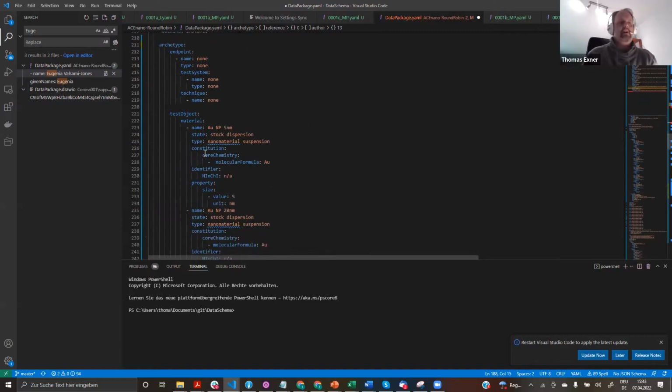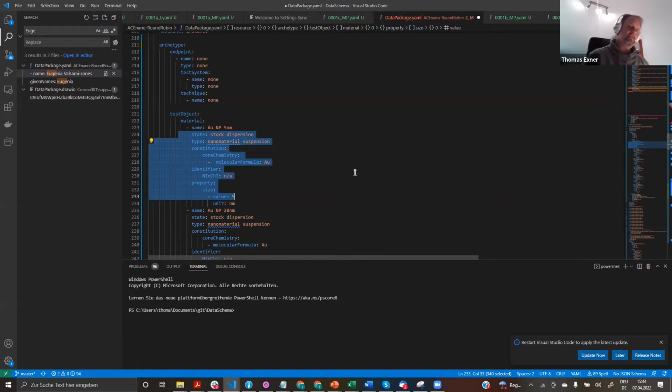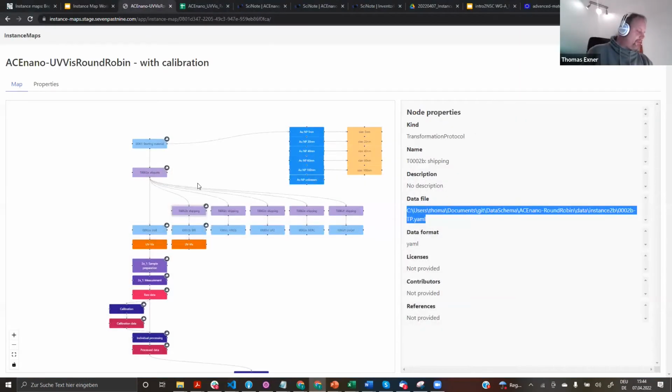You see here that I have the basic information on these particles as well. Therefore, this is a replacement of what the lab notebook is doing. The only reason why I show that is that a lab notebook is much easier to use and much more user-friendly. The only thing which we are at the moment currently working on is making the lab notebook aware of information you have to provide. These kind of metadata standards to see what actually has to be provided. Good, back to that.